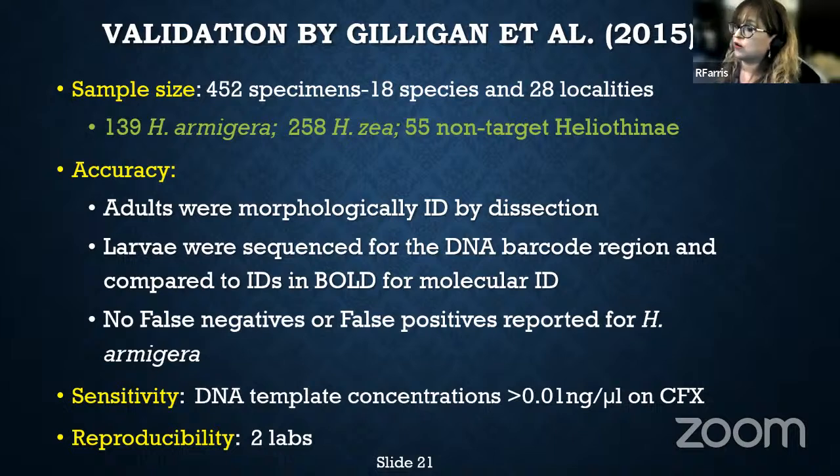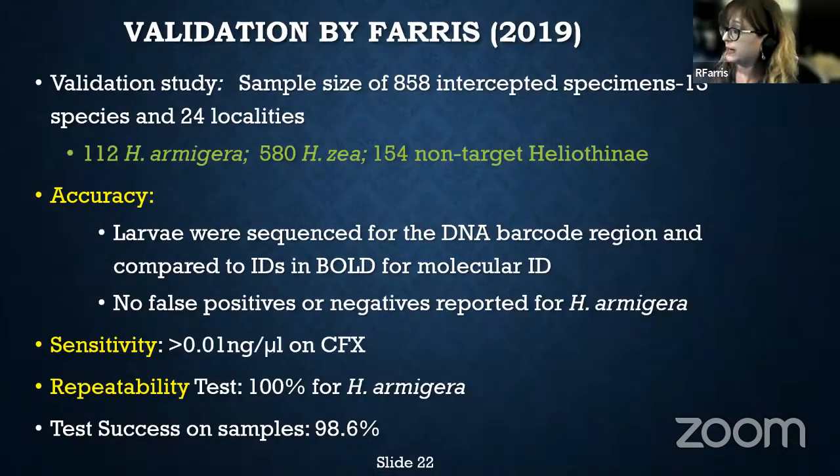before they are no longer amplified with this assay. For this one, we were able to get down really low, to 0.01 nanogram per microliter. And reproducibility: you always want to make sure that you can repeat this assay at different laboratories. So this was also validated at our laboratory, but when we validated, we actually doubled the sample size.